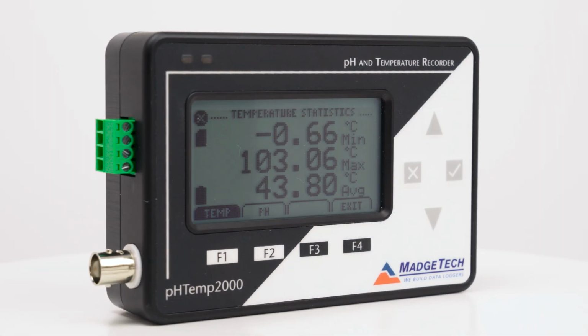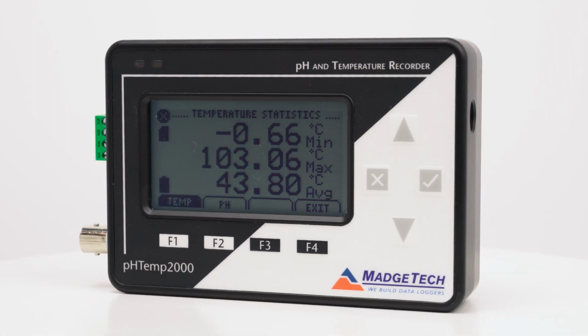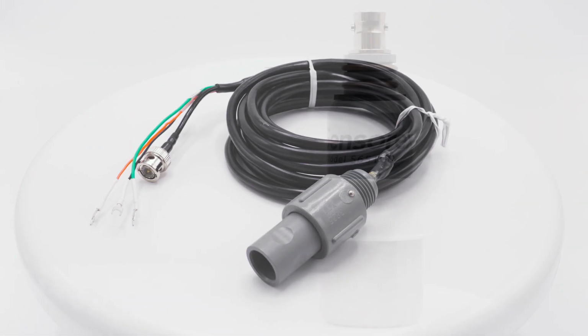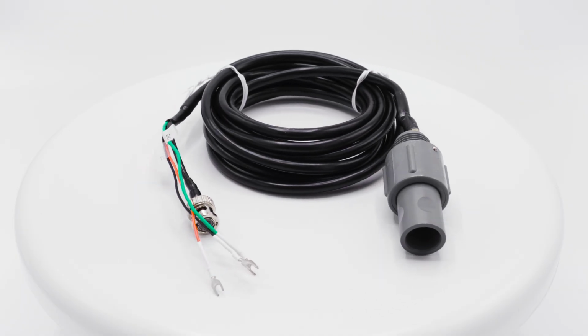Welcome to the pHTemp2000 Data Logger Overview. In this video guide, we'll go over the basic functions of pHTemp2000, some of the different connections available for the data logger, and which ones are right for you.